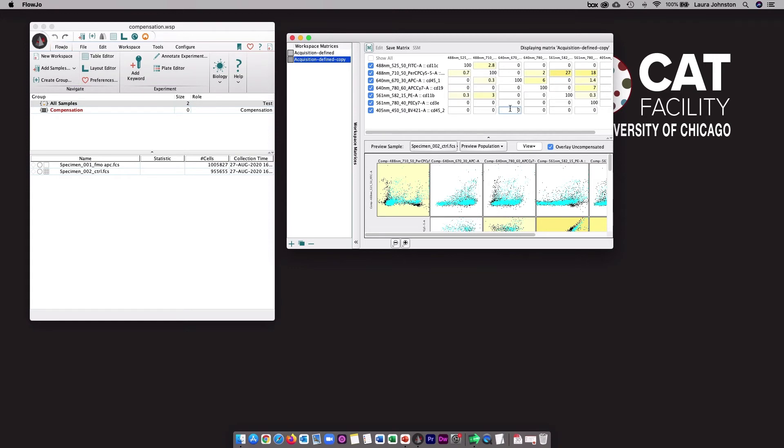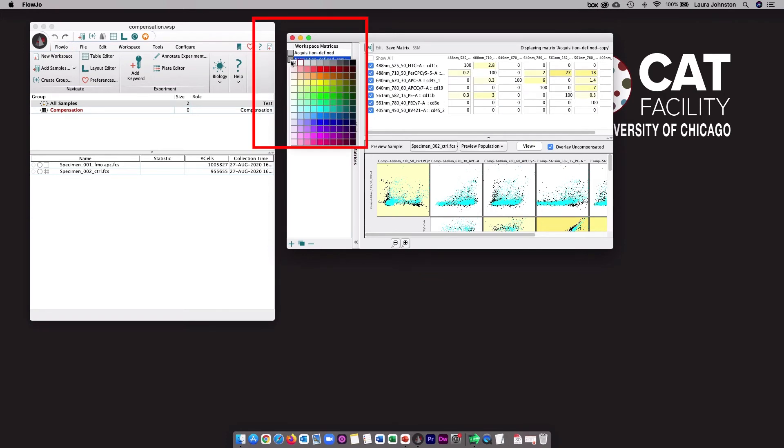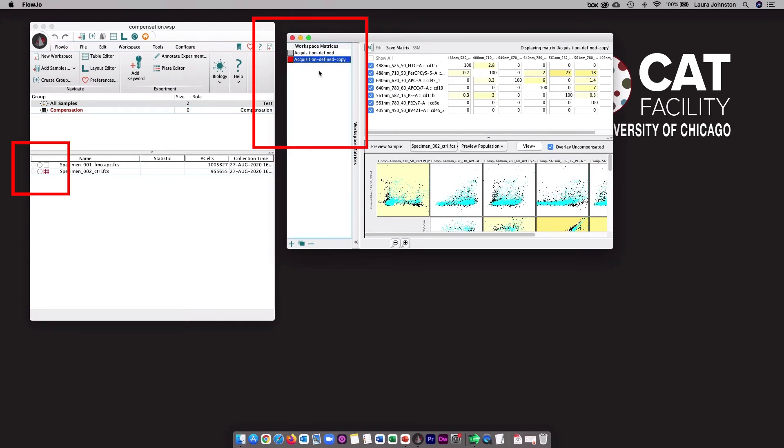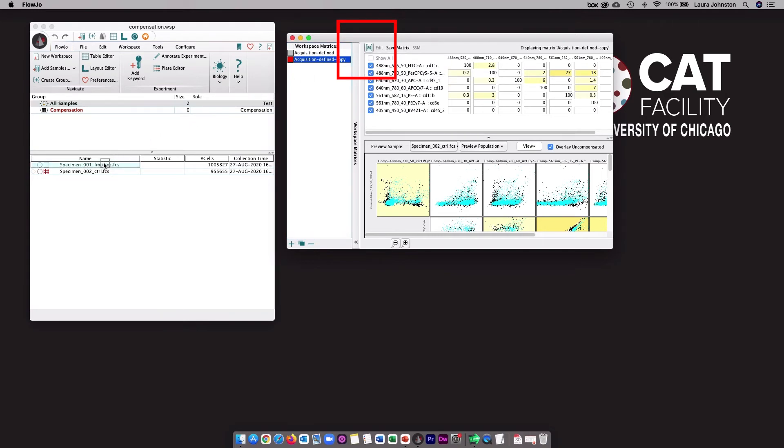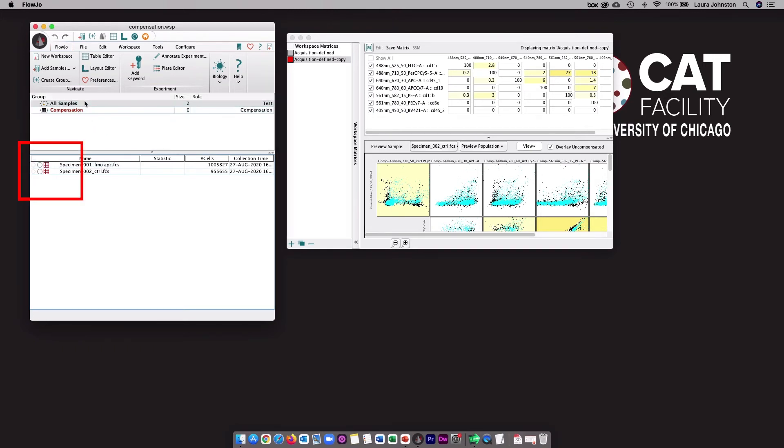Remember that single stain controls should be used to assess if your compensation is correct or not. You can change the color of your matrix, and if you do that, you can see that the color of the grid changes, which will indicate that this sample has the red matrix applied to it. I can even apply the new matrix to other samples using this M button here. I'll just click and drag it over either onto an individual tube, or I can drag it up to a group or the all samples. Once I do that, it will apply to all the tubes in the group.